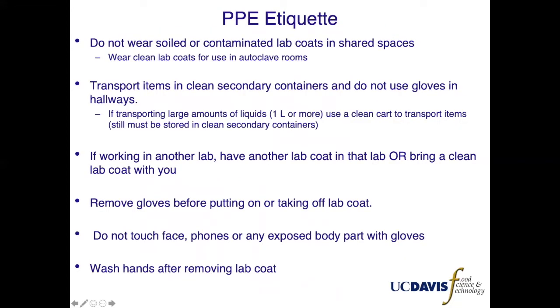I would like to discuss some PPE etiquette. Do not wear soiled or contaminated lab coats in shared or public spaces. This is true for both chemical and biological contamination. Wear clean lab coats for use in autoclave rooms. If you're transporting something to a different location in the building, your items must be stored in clean secondary containers. Do not use gloves in hallways. If you're transporting large amounts of liquids, use a clean cart to transfer your items to avoid dropping and spilling. These items must still be stored in a secondary container.